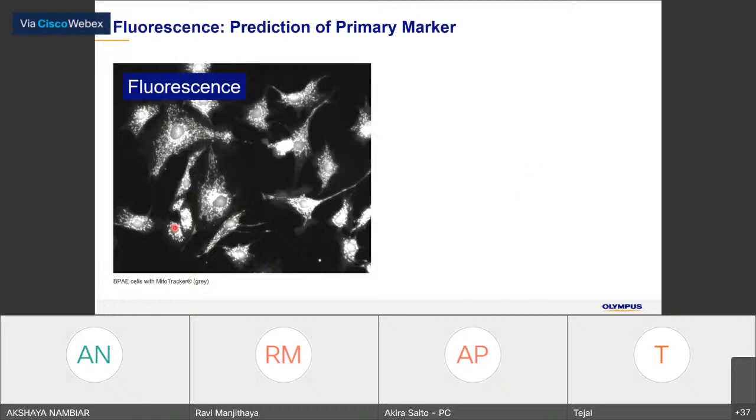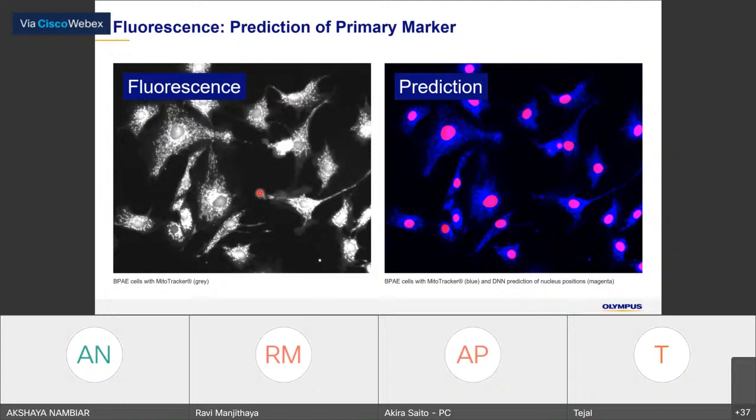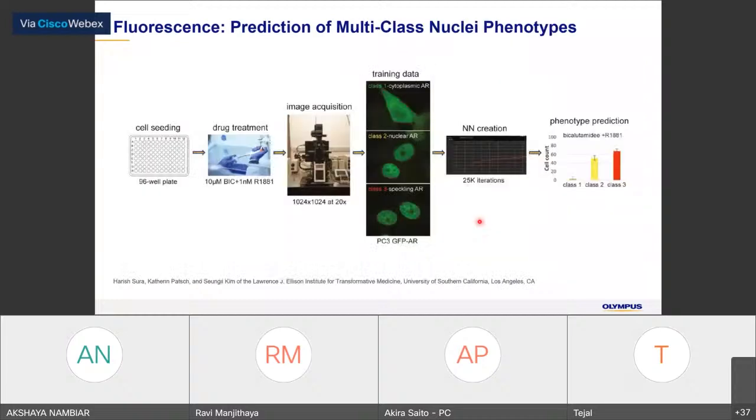But by using just the intensity information, it is very difficult to identify where the nucleus is. But of course, by using the neural network segmentation, we can easily identify where the nucleus is. Even if it is not stained, we can guess where the nucleus is.